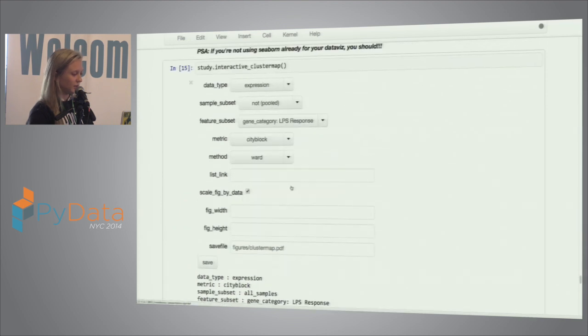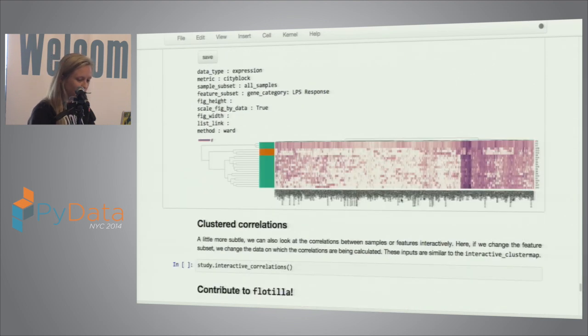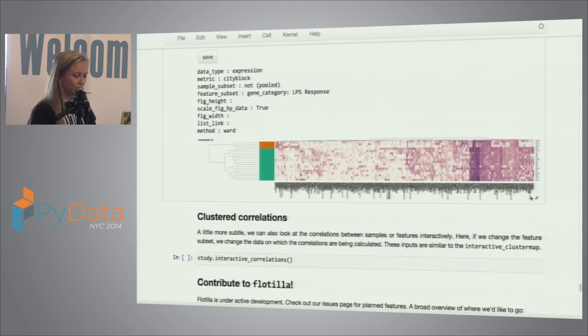And let's also, again, do not cluster the pooled samples. This takes a little bit to compute, so the pooled samples are still up here, and it's still calculating from the black dot, so let's wait a little bit. And again, all right, cool. So now we can see which gene clusters are actually contributing here.